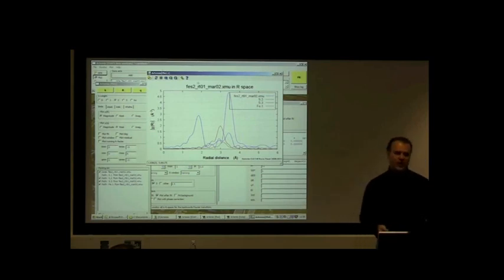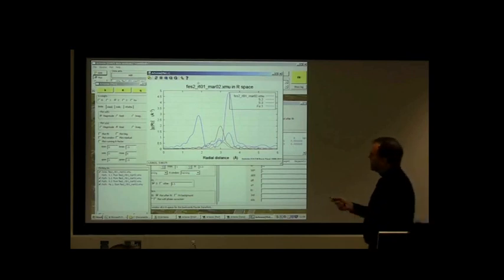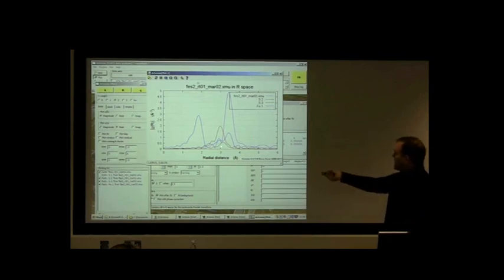But it's not quite that simple. It's more complicated than just pointing at a peak and saying that peak is some atom. And we can already see why, because we have this whole other scatterer here, those 2 sulfur atoms at about 3.6 or something like that. Those two scatterers contribute where this green thing is. And you'll notice there are interesting relationships between the red, the green, and the blue.